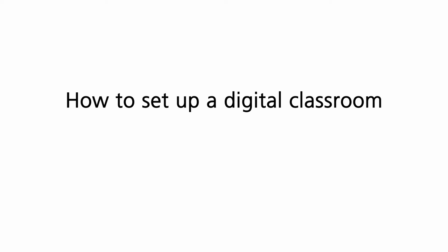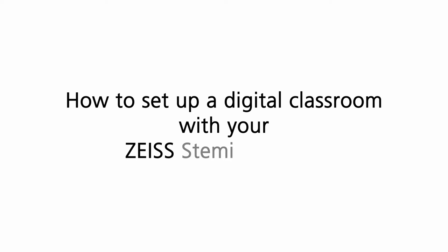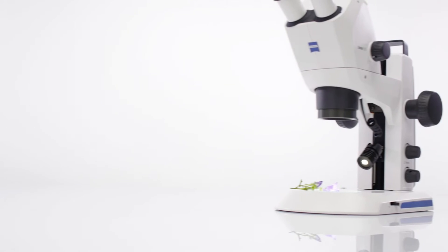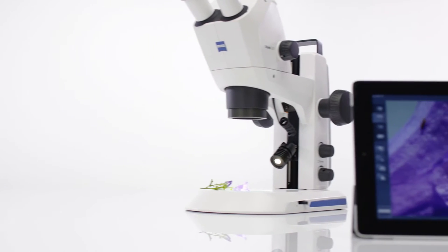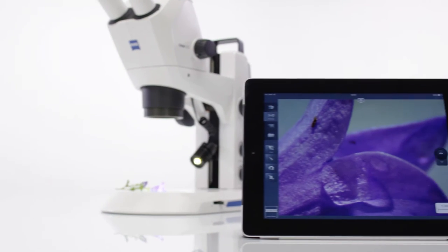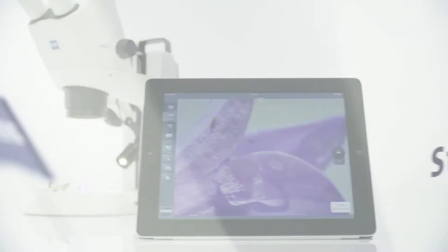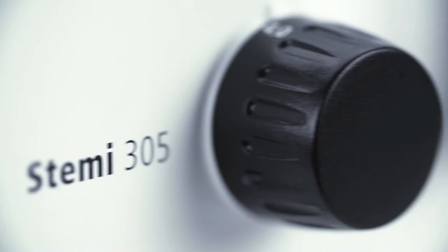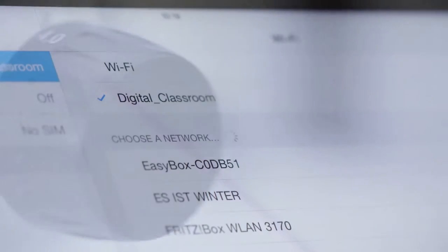How to set up a digital classroom with your Zeiss STEMI 305 Cam. Would you like to make your teaching more interactive? Now you can use wireless technology to engage your students in microscopy.